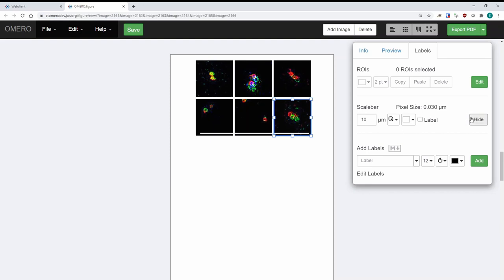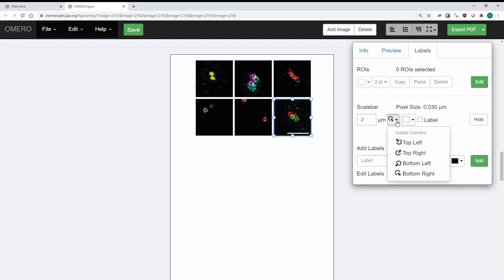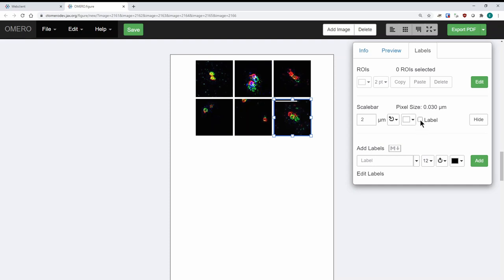Now if I press Show, you'll see that it creates a scale bar that's way too big and it's bleeding through a bunch of images. So instead of 10 micrometers I'm going to say two. Now I have something that's more manageable and I can choose where exactly that's going to be — so instead of bottom right it can be on the top left, for example. And I can add a label if I want, so now it says two micrometers there.